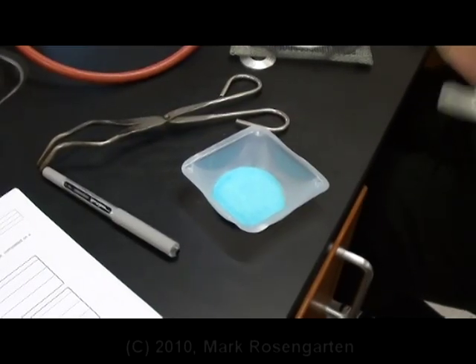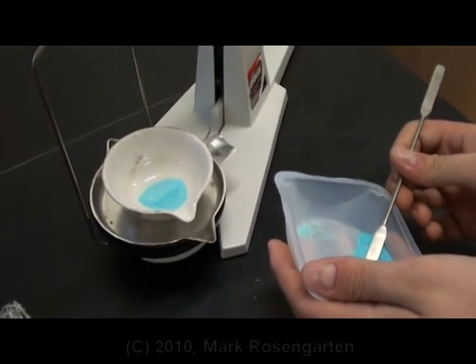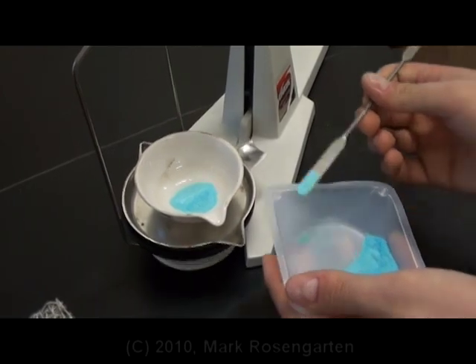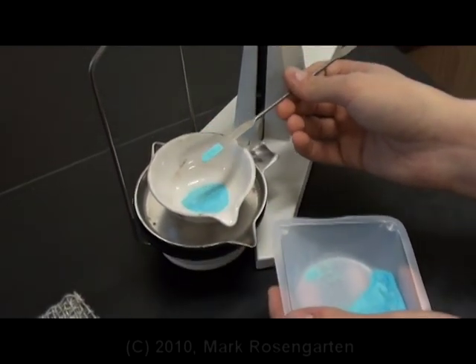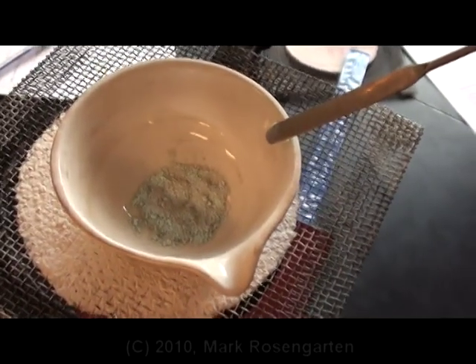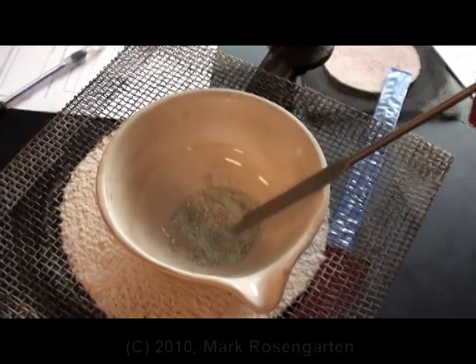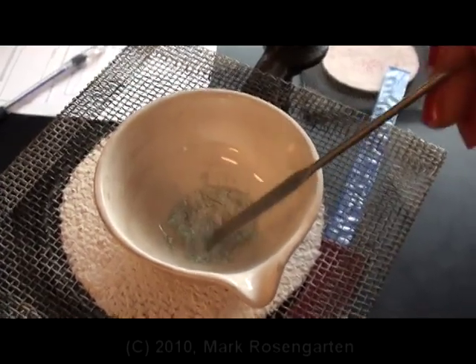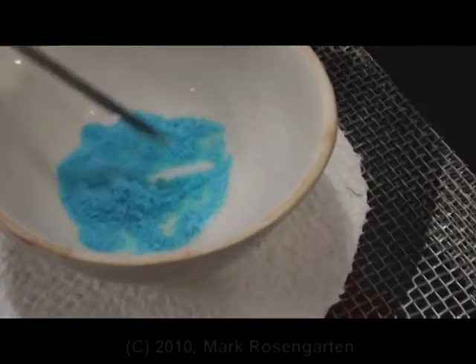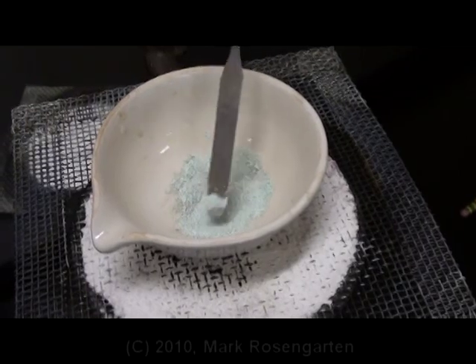The first step is to weigh out the evaporating dish. Then you obtain the chemicals in a weigh boat. Next, you weigh out the copper sulfate hydrate into the evaporating dish until the balance reads 2.000 grams. As heat is added, you'll notice that some of it starts to turn gray and some of it remains blue. You need to keep stirring to break up any clumps so that it all gets evenly heated. If you don't stir, you get clumps. Do not try this at home, but please try it in the lab.